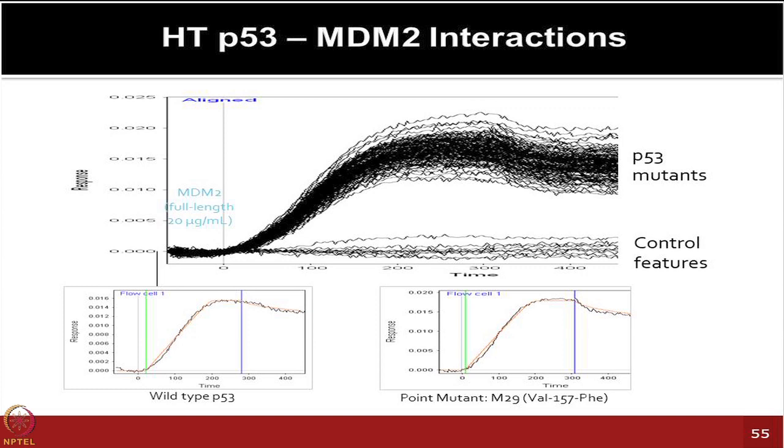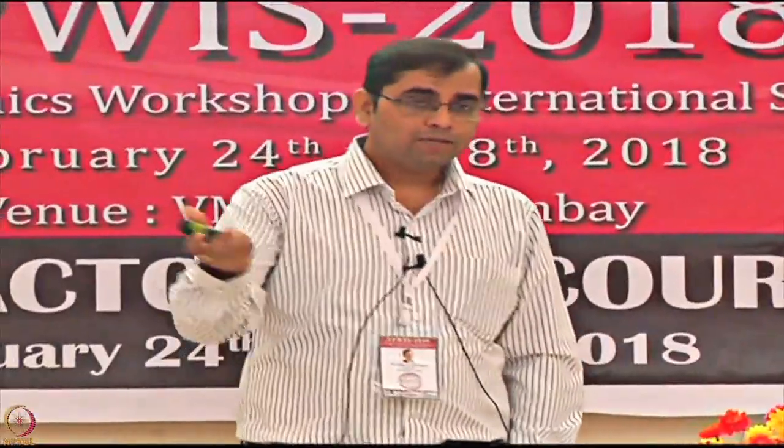Especially, we were also finding that there was probably some sort of bulk effect we could observe even in the control spot. There is some sort of binding which could be observed. So, for the next steps of this technology development, even at that time we were seeing that even for NAPPA chemistry, the HaloTag chemistry which you are seeing now is showing a much more robust signal. So, could we now try out the same thing on an SPRi platform using the revised NAPPA chemistry?